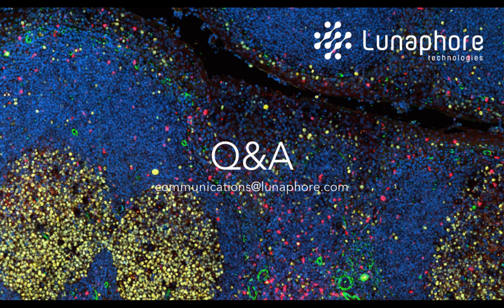Some more questions coming in. What fluorophores can be used in the secondary antibodies? This is important. So it has to match the emission and excitation spectrum of the filters that we have integrated in our instrument. So we optimized for DAPI, of course, Alexa Fluor 555, and Alexa Fluor 647. So as long as the fluorophore that is conjugated to the secondary antibodies covers that, then there is no real other specification for what kind of secondary antibody we need.